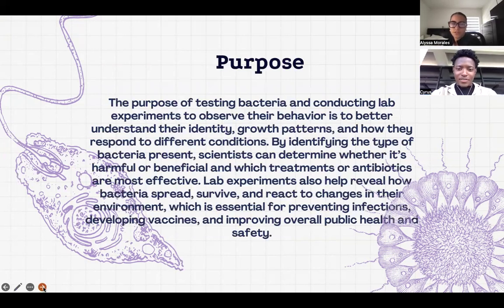The purpose of testing the bacteria and conducting lab experiments to observe their behavior is to better understand their identity, growth patterns, and how they respond to different conditions. By identifying the type of bacteria present, scientists can determine whether it's harmful or beneficial and which treatments or antibiotics are most effective. Lab experiments also help reveal how bacteria spread, survive, and react to changes in their environment, which is essential for preventing infections, developing vaccines, and improving overall public health and safety.